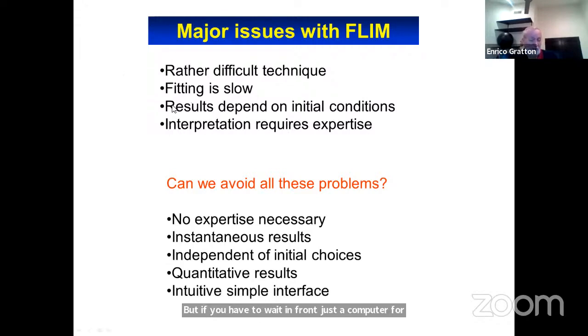Result, the most important thing: the result depends on the initial condition. So if you are an expert and you know what the initial conditions are, you can do better than if you are not an expert, because you have to try everything.